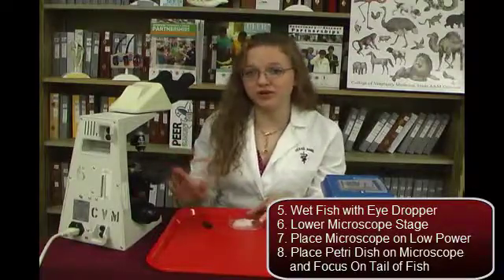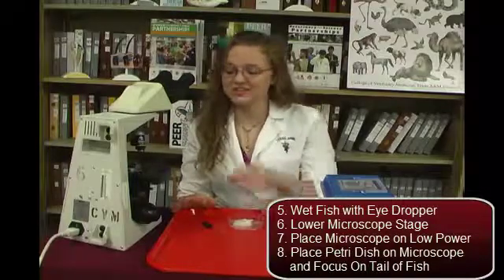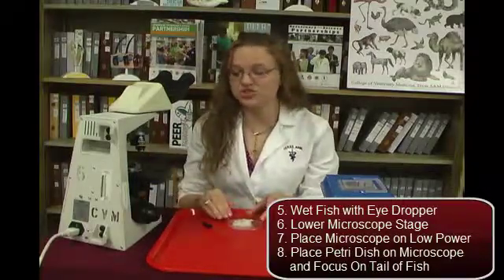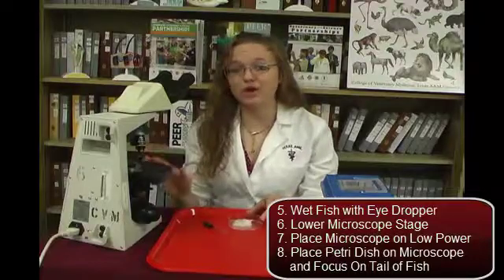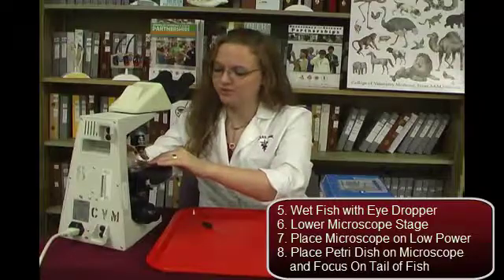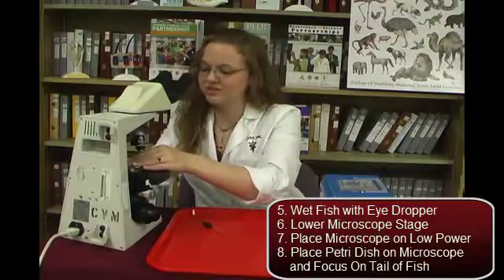Before we put the fish onto the microscope, we want to make sure that the stage is all the way down so that the lenses don't hit the petri dish. And we want it to be on a low power, like 4x. Now we can put the petri dish onto the microscope and focus in on the fish's tail.